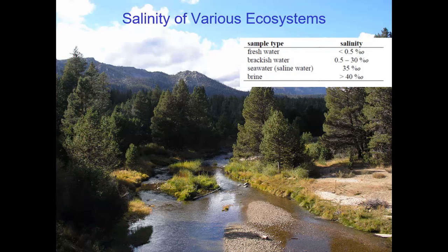And then your salinity is the percentage. And this little symbol right here is not just percent. You have your percent sign, and then this little 0 means that it's parts per thousand. You've probably heard of parts per million. This is just parts per thousand.